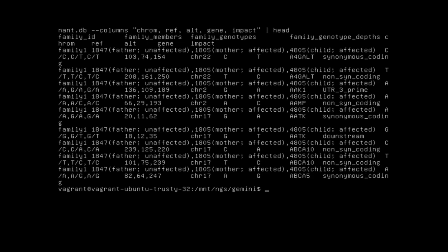The first few columns that are returned include family information, genotype, and phenotype for each individual. But all other columns are the same fields that we have been using in our previous examples: the chromosome number, reference and alternate alleles, the gene name, and the impact. We can filter results using the --filter option, which would serve as the where clause as if we were using Gemini query.